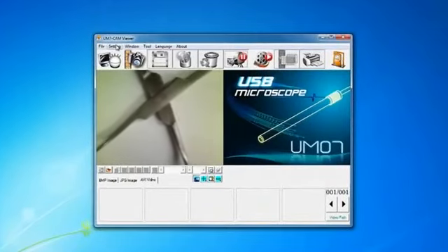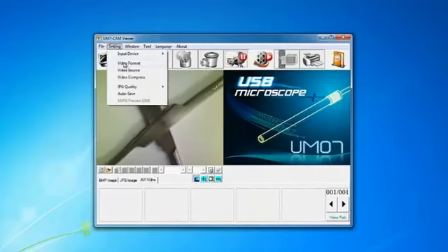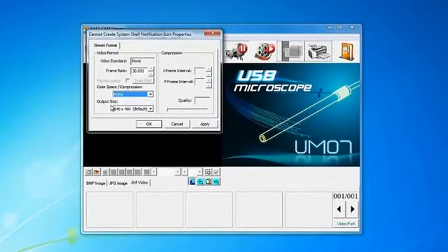If the screen remains black after clicking the Save button, you will want to change some of your video settings. You can do this by clicking the Setting button in the upper left-hand corner. Select Video Format. A small screen will appear. Under the Color Space/Compression section, click the drop-down arrow. Instead of using the current video format, click on MJPG.